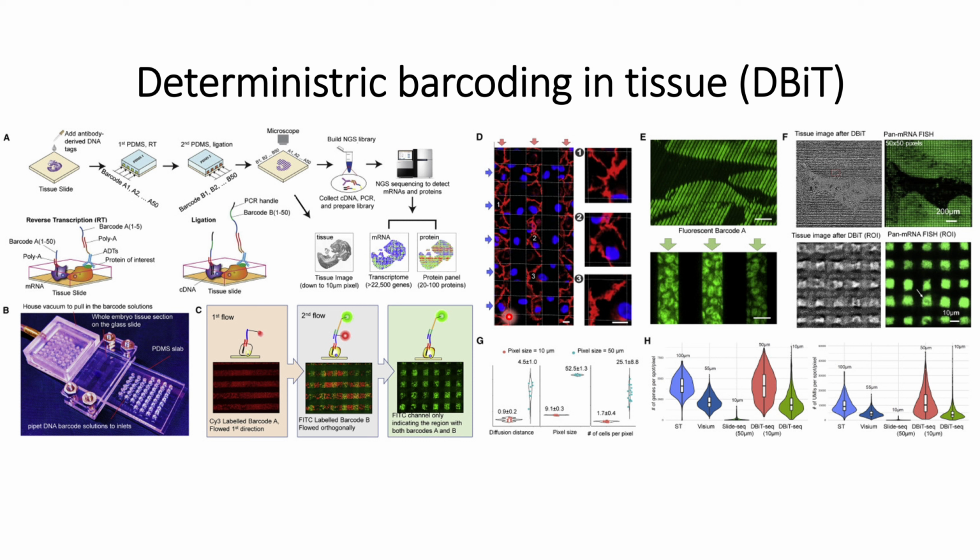And from this study, they can see that even though the channel is cutting the cells at the intermediate, they do not see any leakage of the channel. For example, in this case, we can see the DAPI only at the 1 pixel, and its DAPI signal is not leaking into the other channel, or not leaking into the other pixels. And these are the zoom in views, and we can see the DAPI signals are not leaking into the other channels, and for this case also, and for this case also.